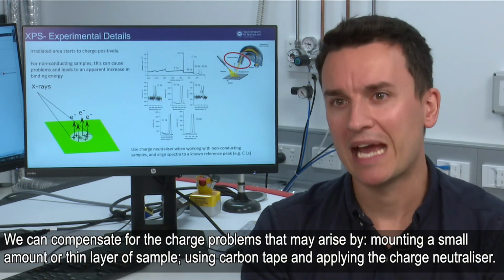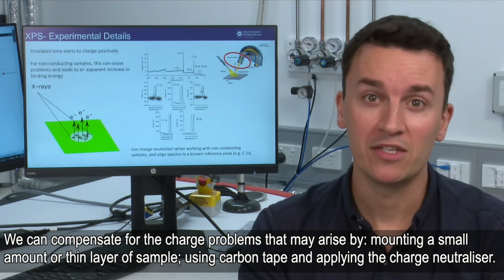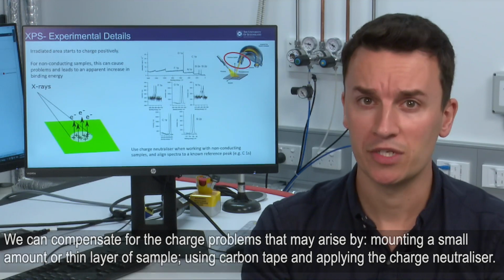The charge problems that we have, we can try and compensate for by using a very small amount of sample when we do the prep, so a very thin layer, or by using carbon tape as well, and by applying the charge neutralizer.